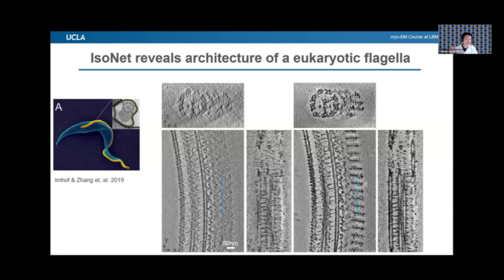IsoNet doesn't implement standalone denoising, so I haven't tested this before, but you can imagine it should be similar to something like Cryo-CARE or Topaz denoise or WARP. They already have the noise-to-noise denoising, so it should be similar to those kinds of applications. It still has the missing wedge, still a very strong missing wedge, but its noise is mostly gone.